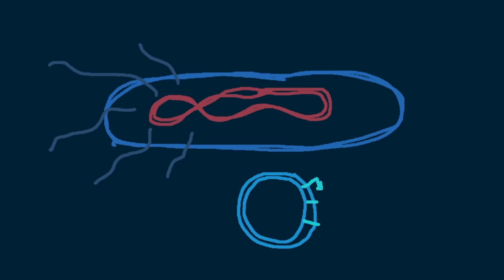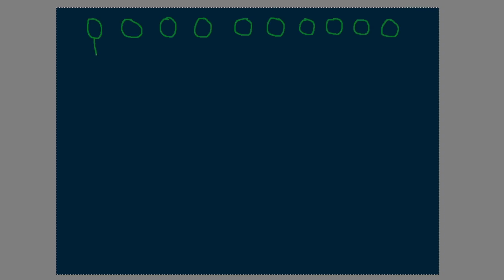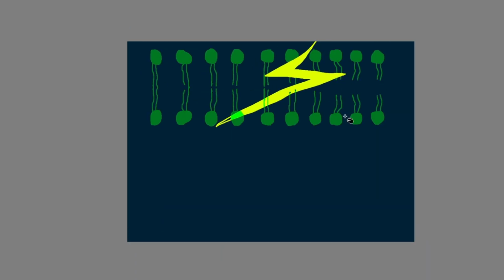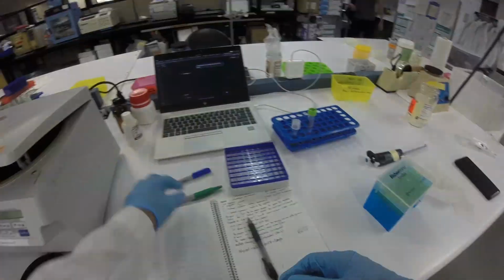I feel like the biologists are more wizard like than the computer scientists. For instance, the lab that we're doing today is, hey, if we have some cells and some DNA and we shoot a lightning bolt across it, maybe the cells will start to glow. And in fact, this is what happens. It's called electroporation. It's basically using an electric field to create pores in the cell membrane so that small molecules like plasmids or other molecules can get in. And so that's what we're doing today.